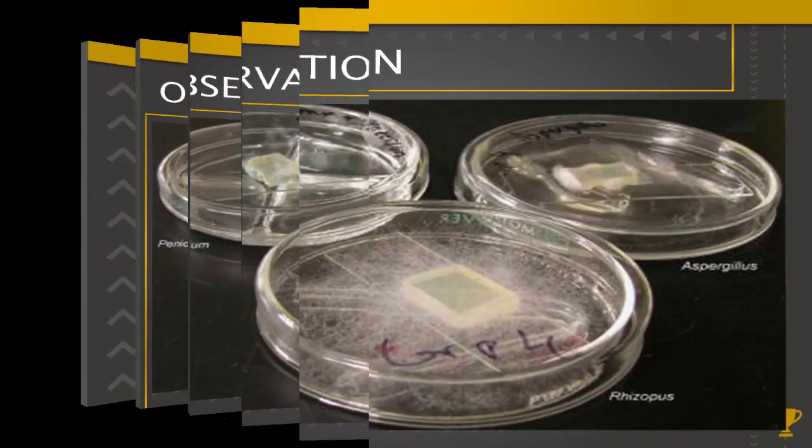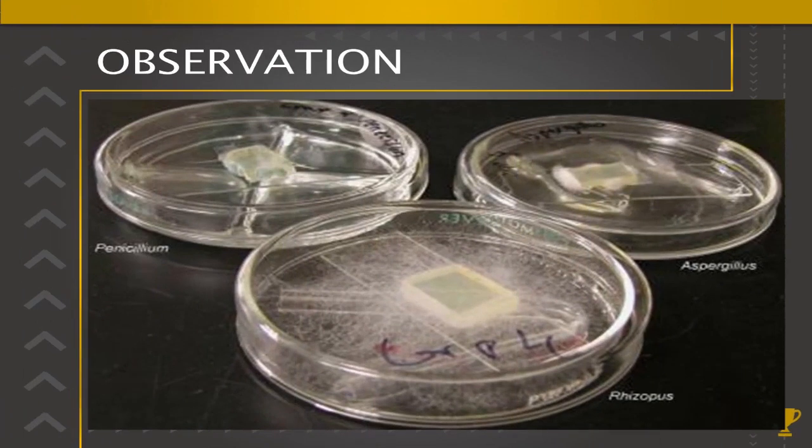To observe it under the microscope, first take another clean glass slide, place one drop of this LPCB, open the Petri dish and take your slide culture, remove the cover slip and place it on top of the drop of the LPCB mount which you have taken, and then observe it under the microscope.